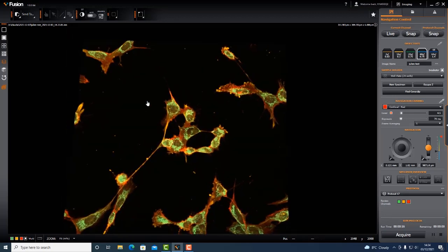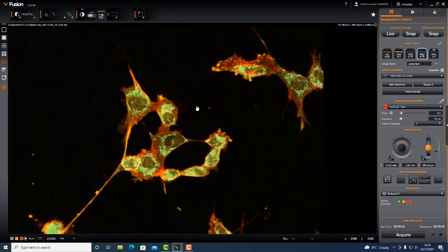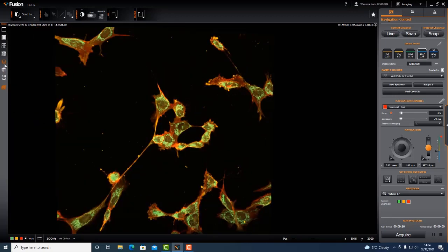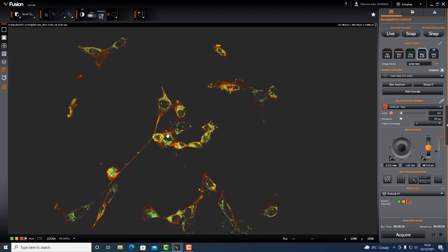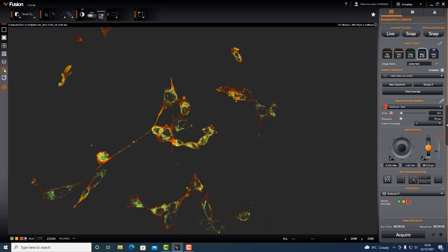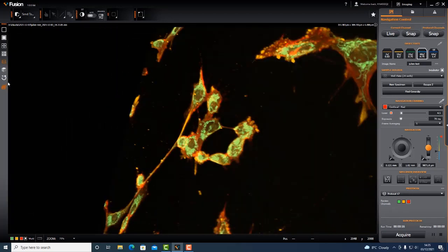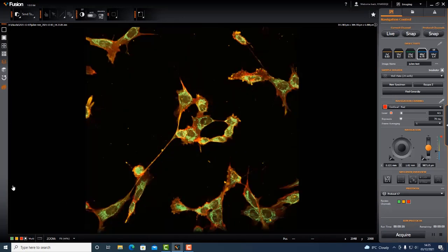So left to tilt, right to pan, and middle mouse wheel to zoom in and out. And we have another display mentioned here. It's called a blend mode, and it combines intensities along the viewing direction, so it gives you a sense of depth with a background. Oh, and if you get lost, for example, and you want to just square it back up again, you have a reset button.